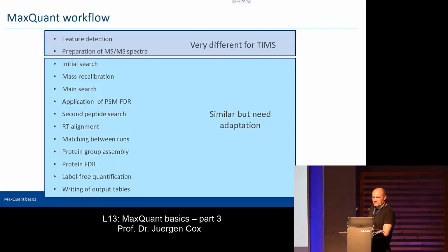Nevertheless, we still had to do some work on that as well to have basically the correct reference of these steps to the raw data, which is now quite different, right? But there's no real algorithmic new conceptual things that one would have to do here. So it's just plain work, basically. But here, of course, the algorithmic concepts are quite different from the usual LC-MSMS data.